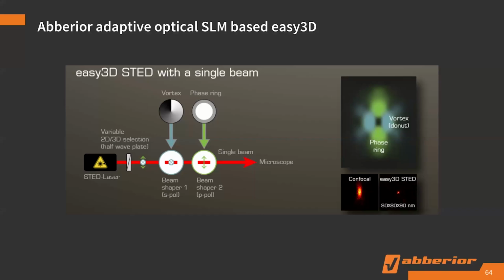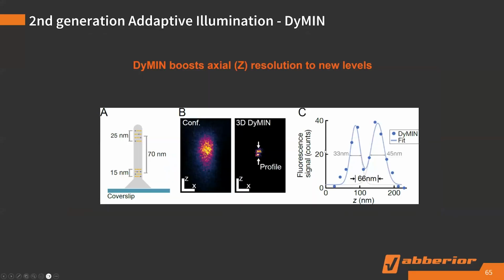And then you have the confocal excitation beam merged together with this 3D STED PSF. Then only the middle part is shaped to a perfect isotropic ball. The middle part is scanning your sample. The resolution is improved isotropically in X, Y, and Z. So we can test with a nanoruler. This nanoruler in the Z, it's 70 nanometer apart from each other.